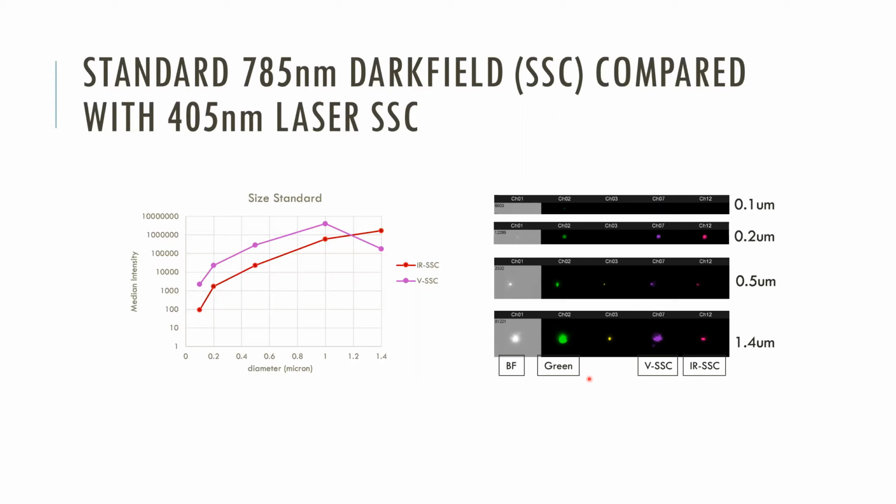At the time that we did this research, we had started with the polystyrene beads, and so we continued with the polystyrene beads. In my opinion, the ZetaView is a great way to get the size of the particle, and what I'm looking for here is to look at heterogeneity primarily. I think probably there's a few EVs that I miss when we do this analysis. However, I think we get enough of them to be able to take a good sample down to somewhere under 100 nanometers, although it's hard, like we said, to give a direct cutoff because of the refractive index mismatch. All right, I'm going to go on from here.